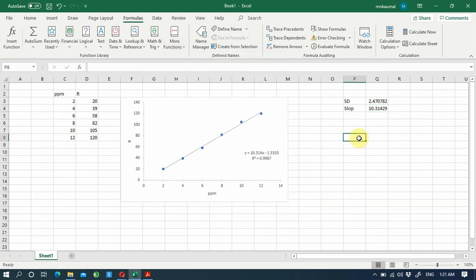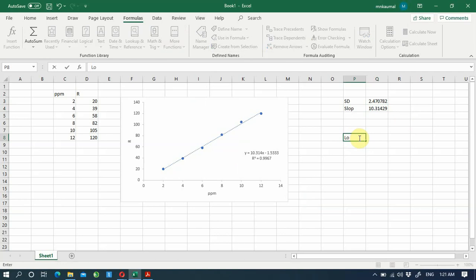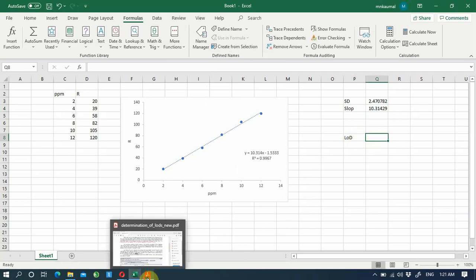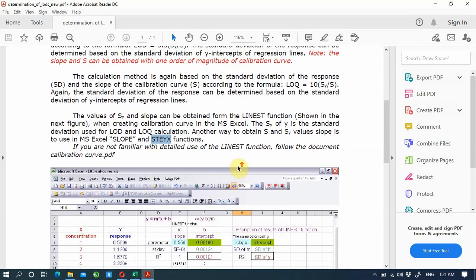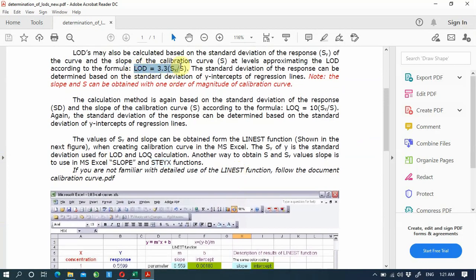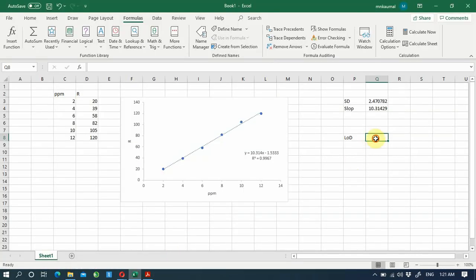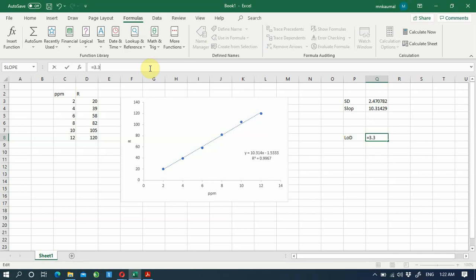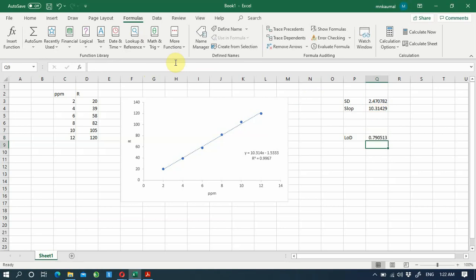Let's do the LOD calculation. LOD is 3.3 times the standard deviation of the graph divided by the slope. In Excel: 3.3 multiplied by the standard deviation cell, divided by the slope cell.